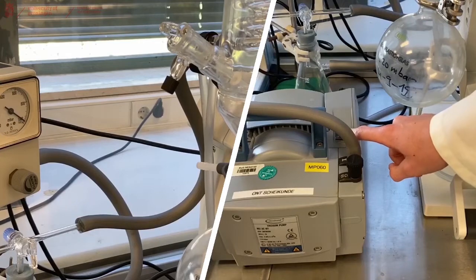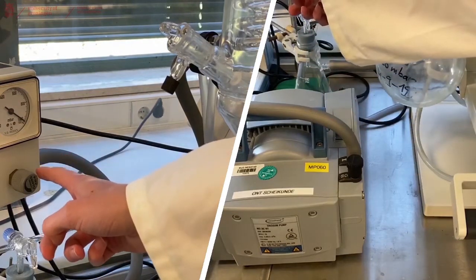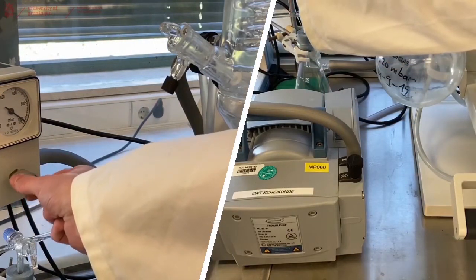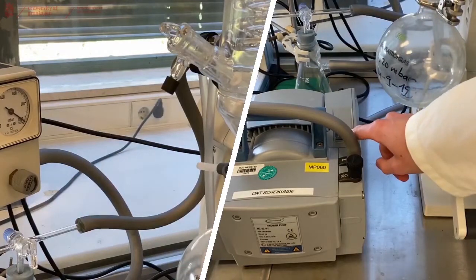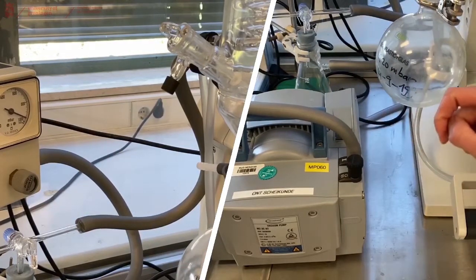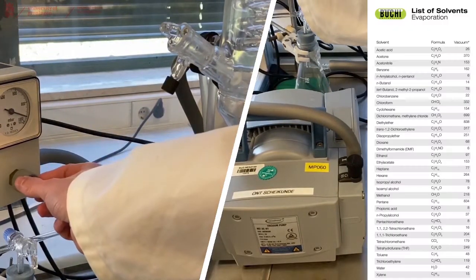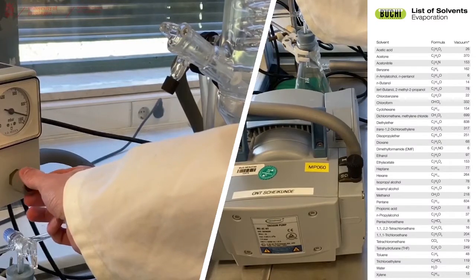Make sure that before you turn on the pump, that the pressure gauge is all the way in the open position. Turn on the pump. And slowly close the pressure gauge until it reaches the pressure you need for your solvent.